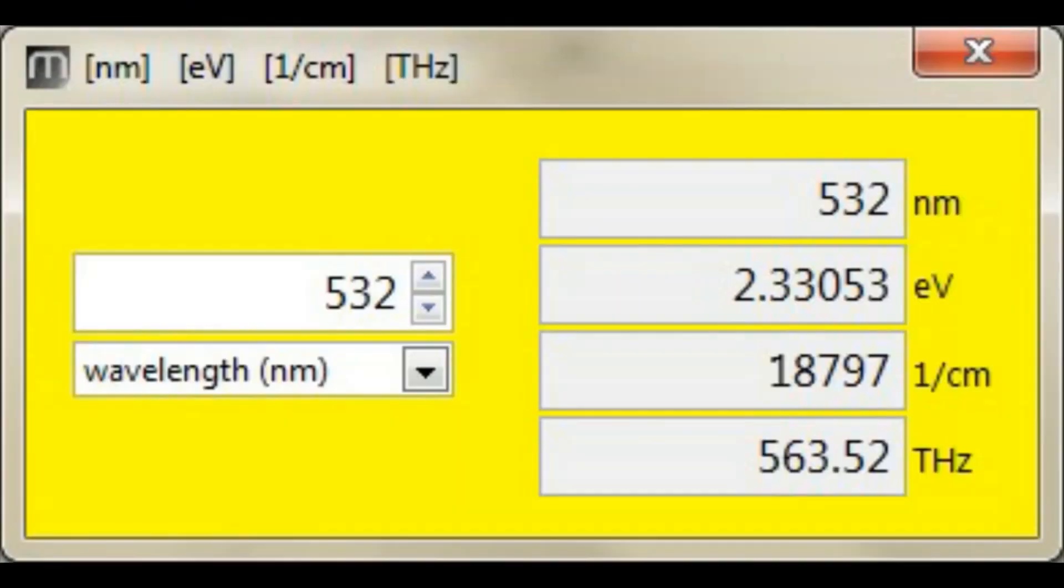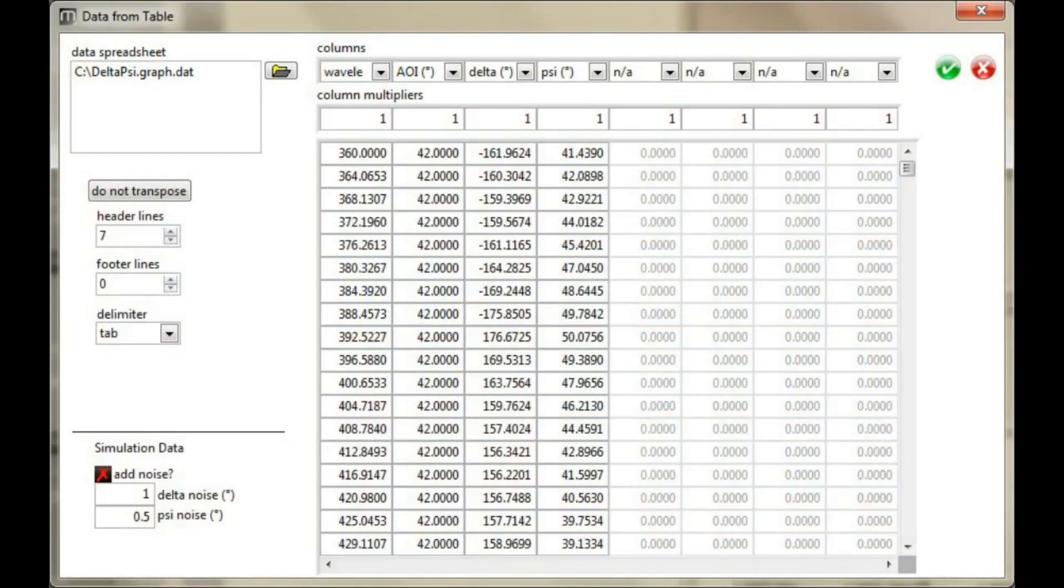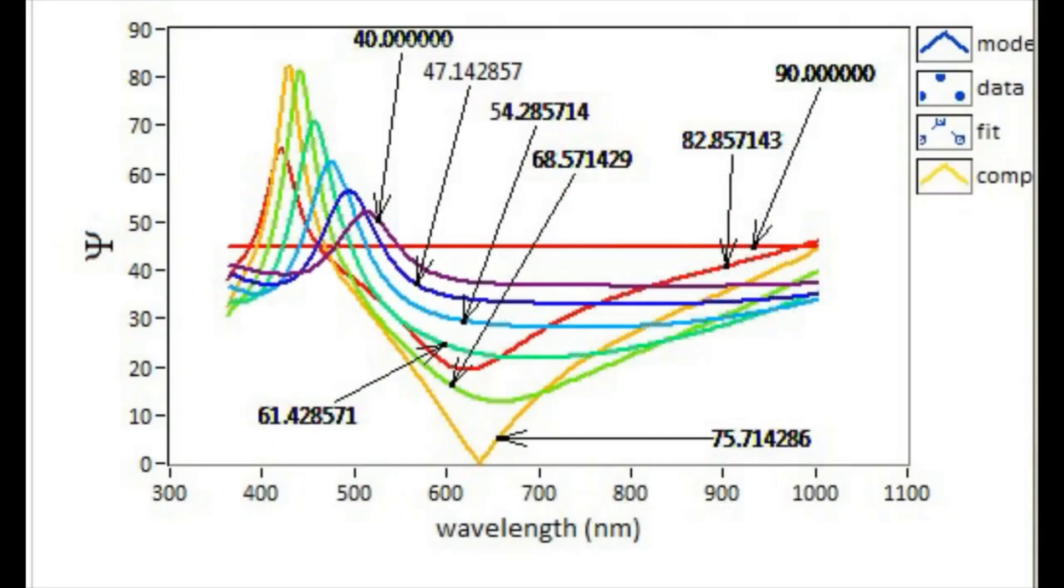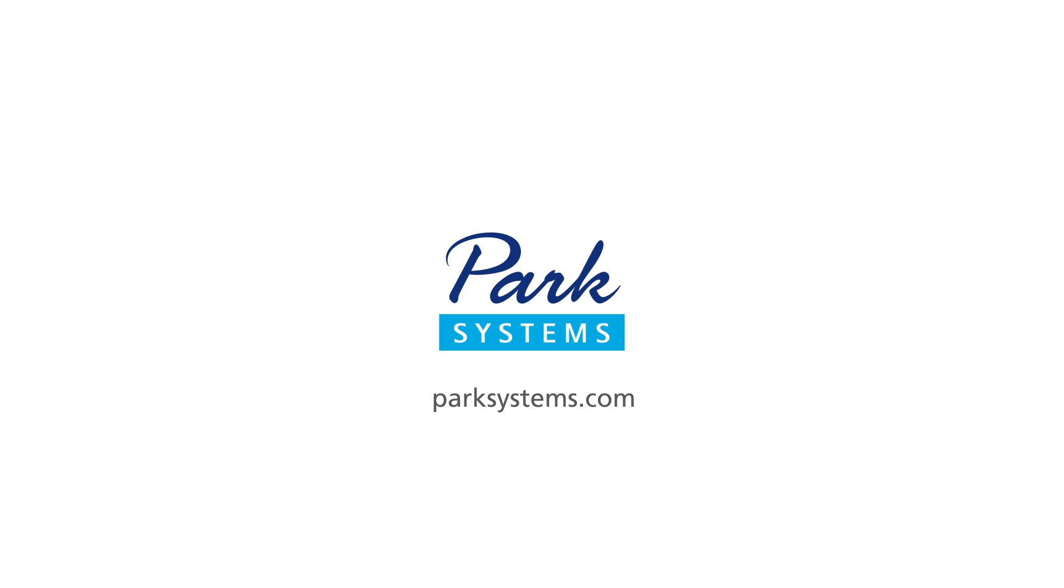There are many more functions and details within the EP4 model that will help you get to the results that you are looking for. We are sure that the new EP4 model will help you gain maximum performance from your ellipsometer and would like to thank you for your interest.